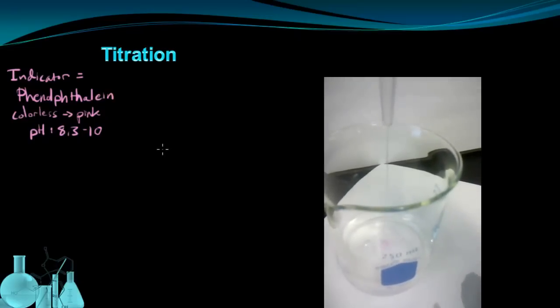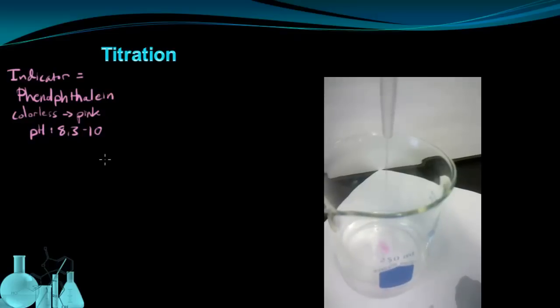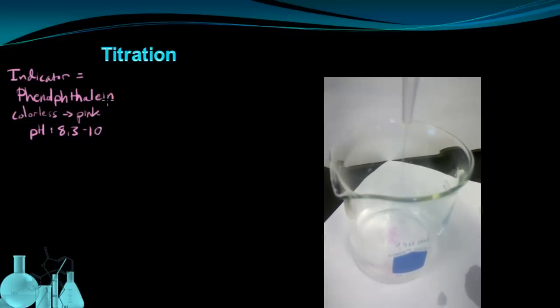You can see that right where the base contacts the acid, we have a color change. But it's not a permanent color change. We're only seeing that initial pink because the base is turning the phenolphthalein pink right where it hits the acid. But then it's very quickly neutralized.